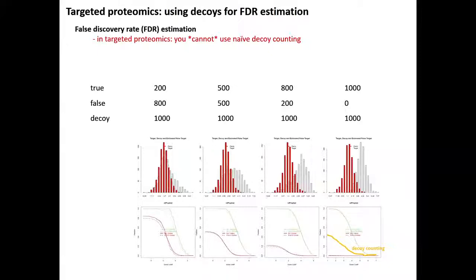So what we do is we actually model this decoy distribution. Some software have some tricks, like Spectronaut, for example, which doesn't extract one-to-one decoys. It extracts something like 10% decoys. So the decoys, basically the red bars, come here. And as you say, if you use a big spectral library, you basically get a huge decoy space on top.